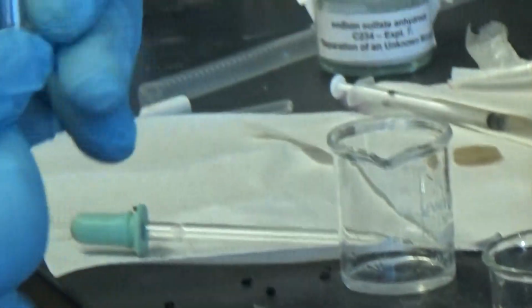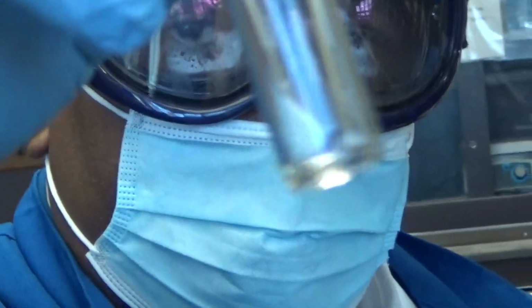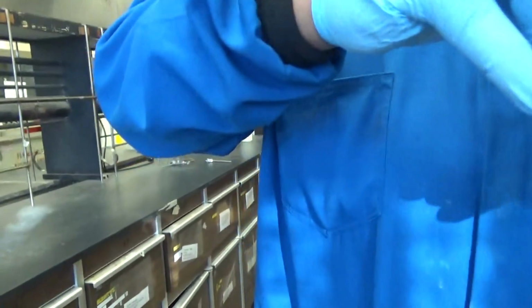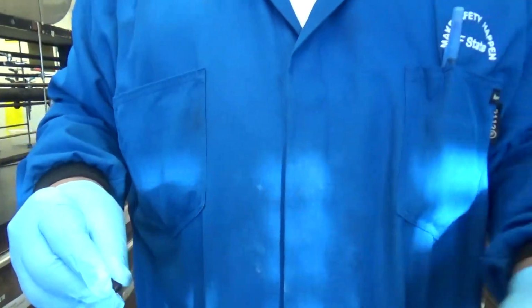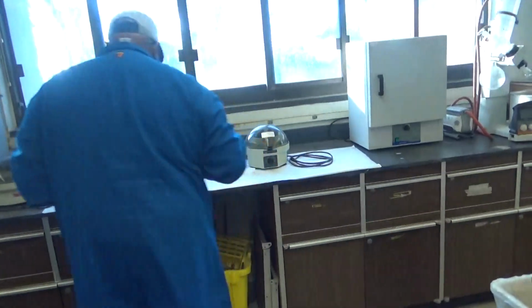And what does it look like? Let's look at it. Oh, you want to cap it? We can inspect it. That's our product here. So that should be relatively pure. It's crude, but probably pretty clean. That's our ketone. Let me smell it again. It doesn't smell good, eh? I told you it's stinky. It smells like burnt rubber, kind of.